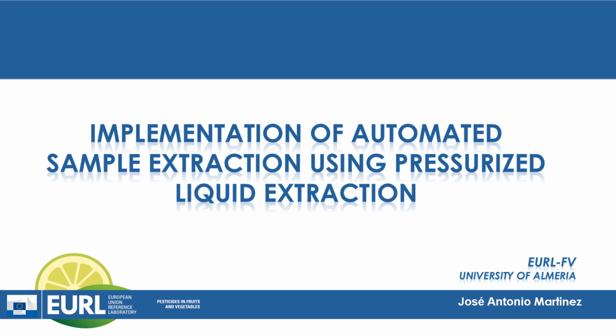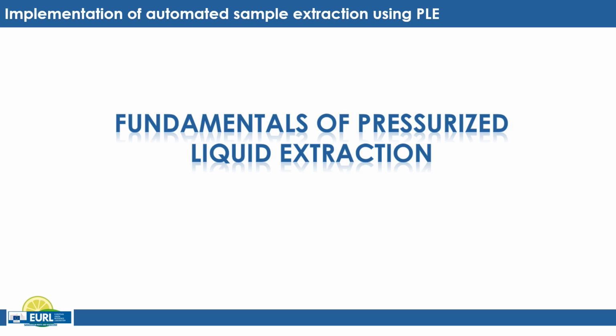In this tutorial, I'm going to talk about the implementation of automated sample extraction using pressurized liquid extraction. First of all, I'm going to explain the fundamentals of pressurized liquid extraction, which from now on I'll refer to as PLE.